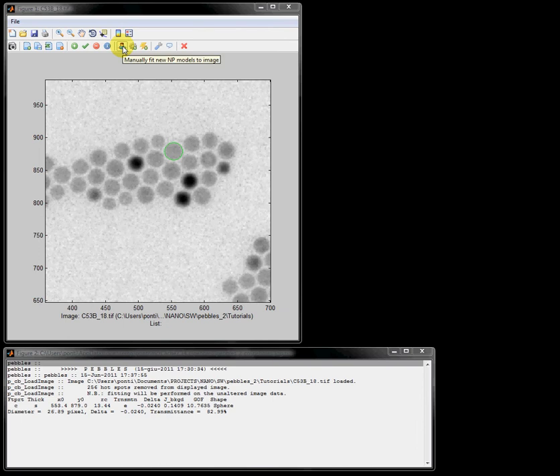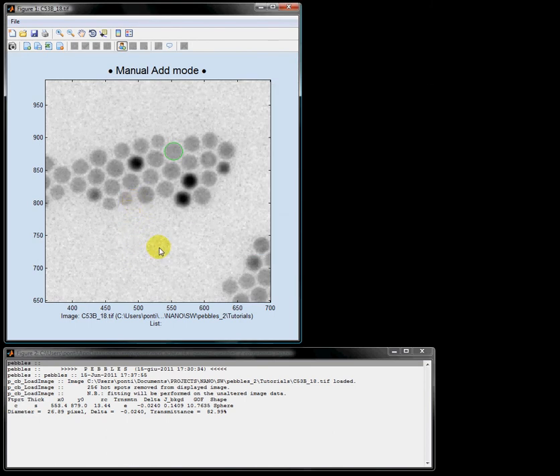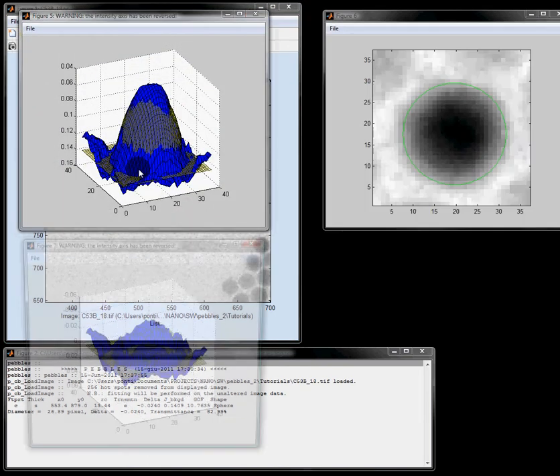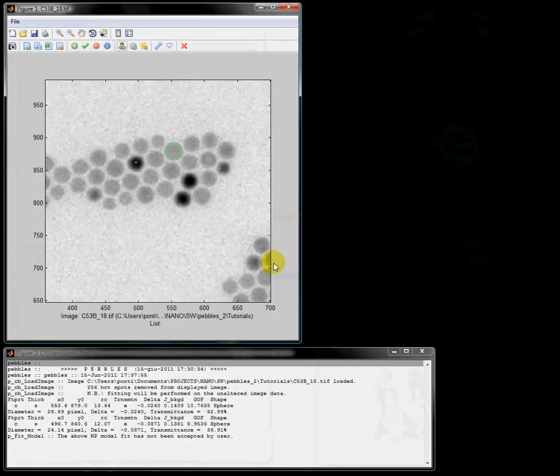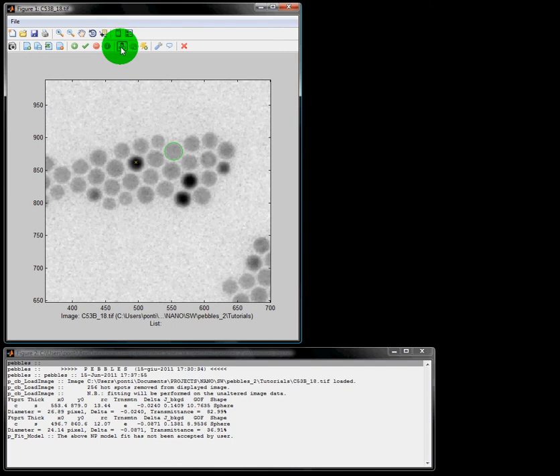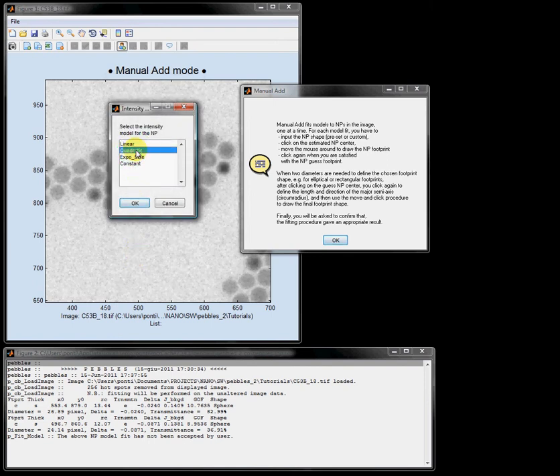Let's fit another nanoparticle: sphere shape, linear model. I choose one of those very black nanoparticles. In this case let's say I'm not satisfied with the result, because you can see that the intensity surfaces are different. So I do not accept the result and a small yellow cross appears where the guessed center was. What I want to do now is to fit this nanoparticle again — spherical shape — but now I choose a quadratic intensity model.